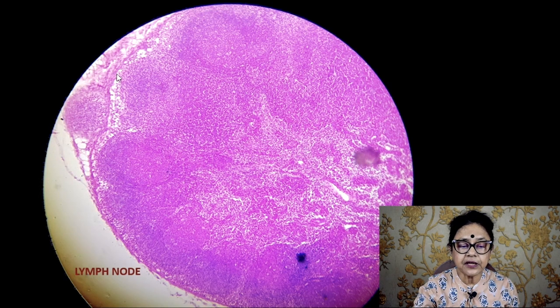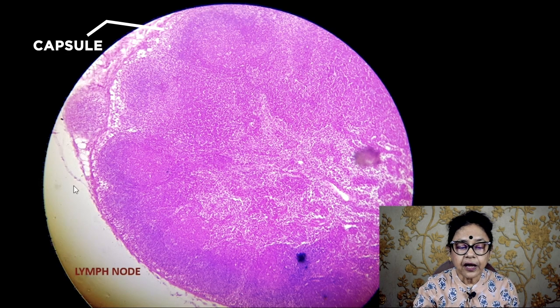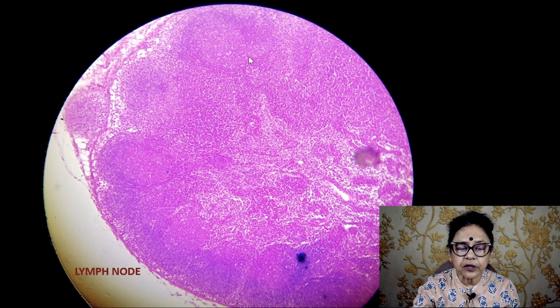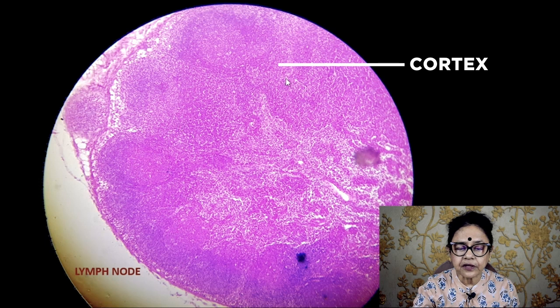In the lymph node, this is the capsule of the lymph node — this border — and beneath the capsule is also the capsule, because this part is torn away. You will visualize it like this: the white color area is the subcapsular space, and beneath the subcapsular space there is the cortex of the lymph node.